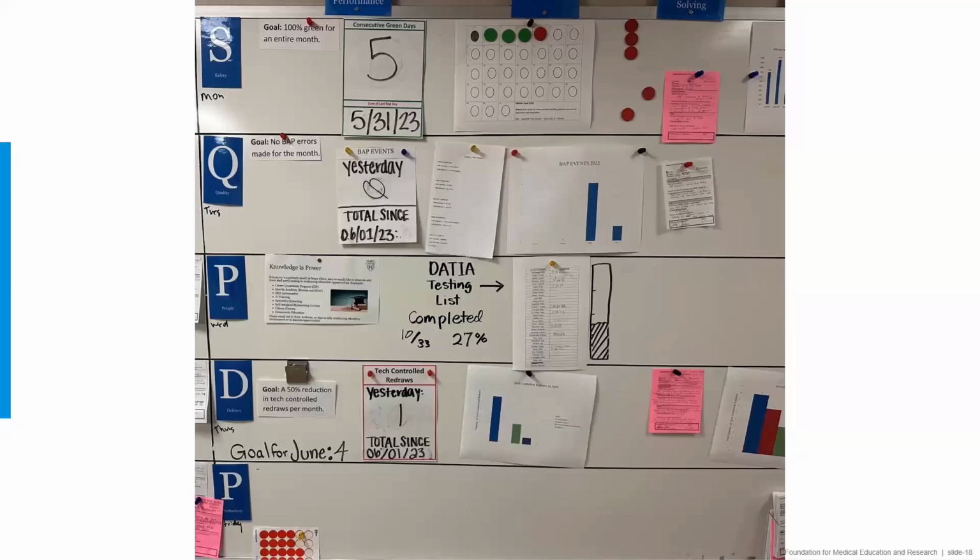It's going to take a little bit of time to get used to, but once you do, it's very seamless, and the lab techs and everybody in the lab engage in this. They use this as their communication. It's like a dashboard for how you are running the lab, and also for looking at issues within the lab and resolving them.